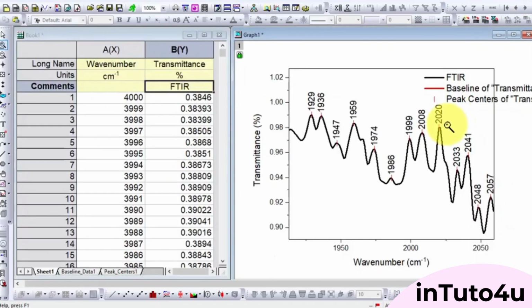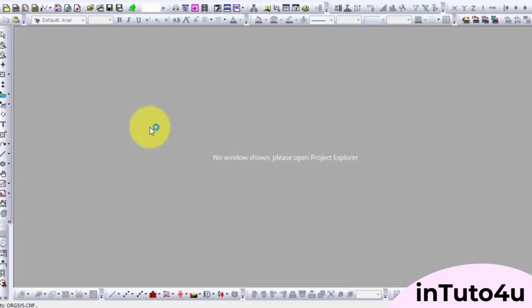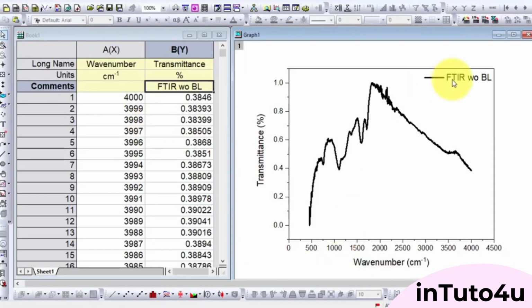But most of the time we don't need such kind of peaks for FTIR. We are having a situation like this one, that we will have to find peaks, and the peaks are few, not that many. So, automatic peak finding will find all the peaks, which will be the result of the oscillations as well. So, one way is, we smooth the data and we find peaks, because in FTIR, we are not interested in the peaks here, they are here, but we are interested only, for example, in this peak, and this absorption, and so on.